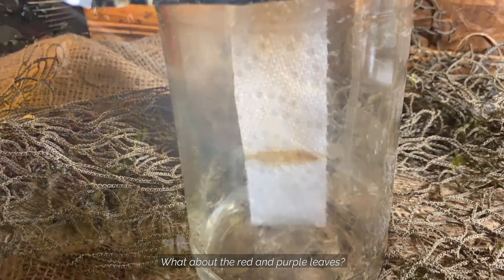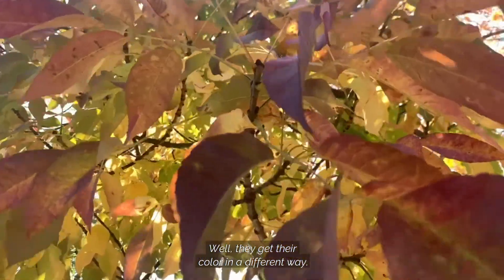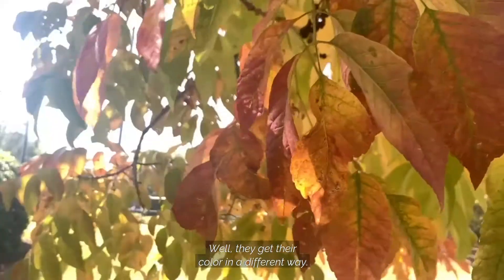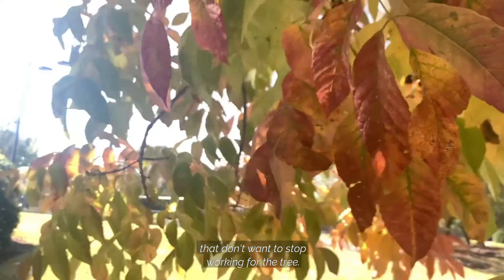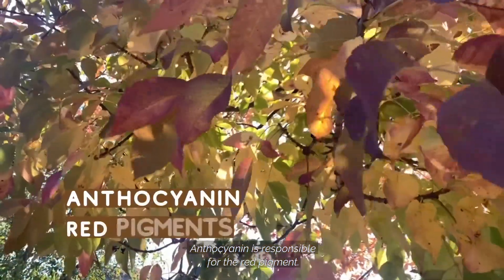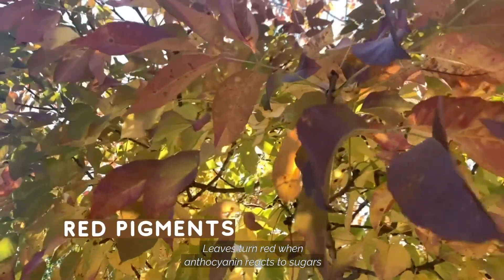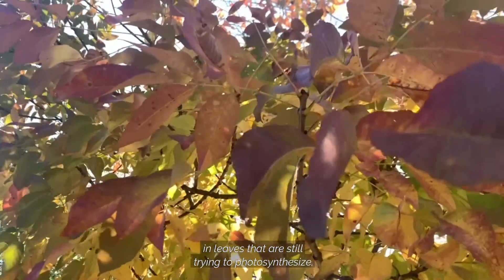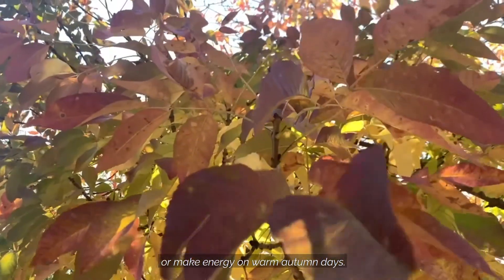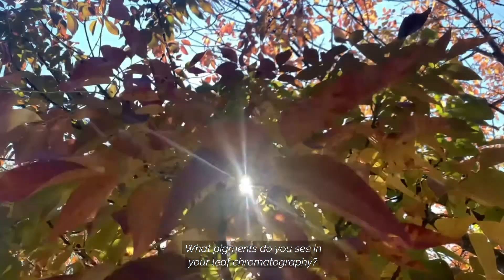What about the red and purple leaves? How do they get their colors? They get their color in a different way — they come from stubborn leaves that don't want to stop working for the tree. Anthocyanin is responsible for the red pigments in leaves. When anthocyanin reacts to sugars in leaves that are still trying to photosynthesize or make energy on warm autumn days. What pigments do you see in your leaf chromatography?